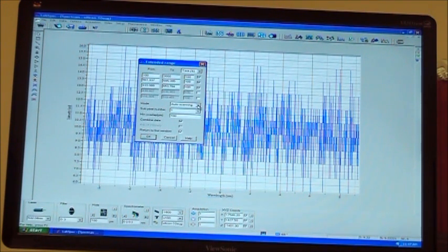And then it won't be able to overlap it nicely. It'll just leave your data separated and kind of draw a diagonal line going up to attach it. So it doesn't work too well with fluorescence. And that covers our little multi-window. We'll put this back to single window mode right now for everybody else.